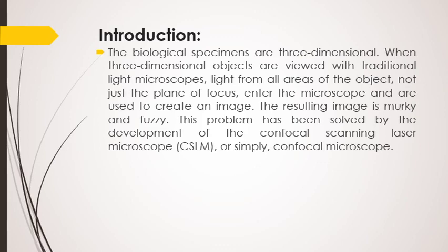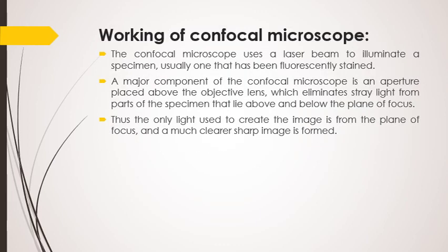And such an image is mostly very fuzzy. This problem has been solved by the development of the confocal scanning laser microscope, or simply the confocal microscope. So here we have the simple working principle of the confocal microscope.